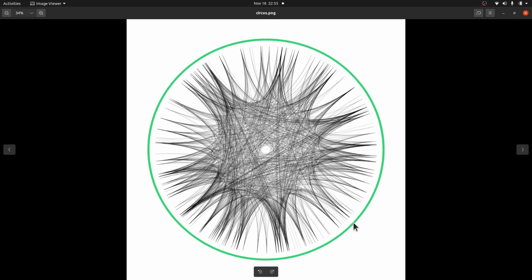So we have our ideogram representing the sequence, the chromosome, the genome, and then we have the length. So if let's say we have a line from this side to this side, that means that is what a sequence repeats. So this can let us know the sequence repeats that we have. This can help you to visualize, and you can even know the areas where we have lots of repeats. So these are things you can do to visualize your data so that you can identify the patterns. Okay, so that's what we have.